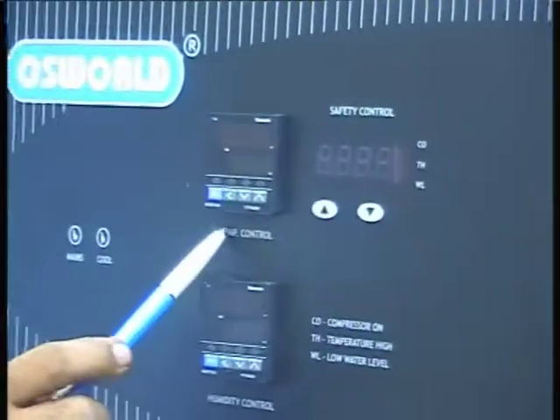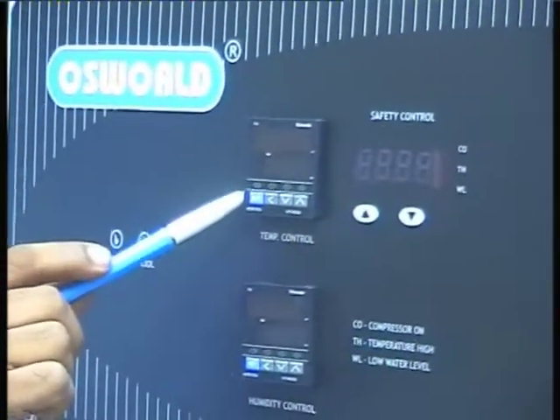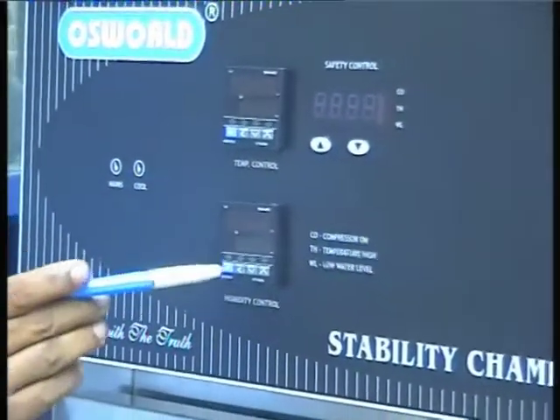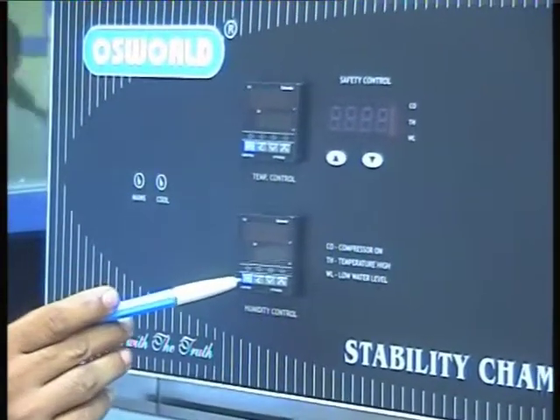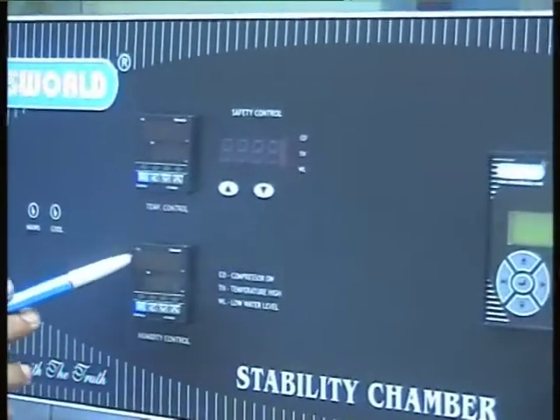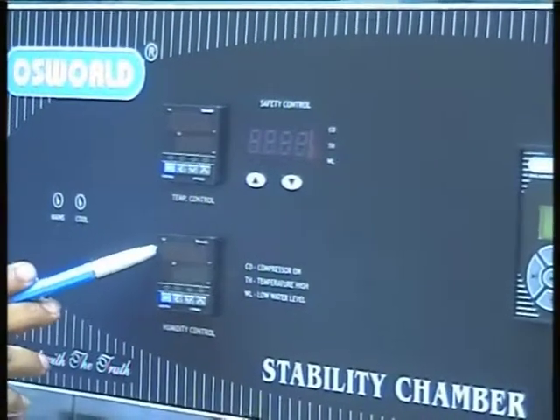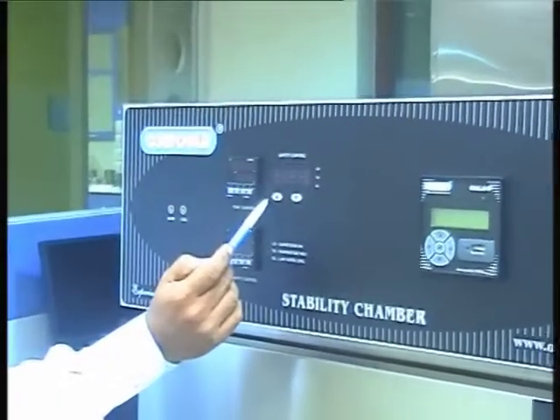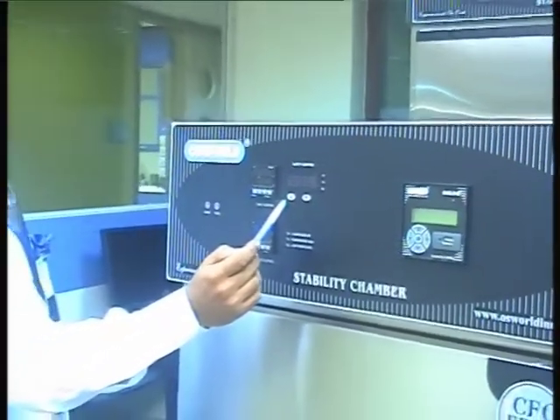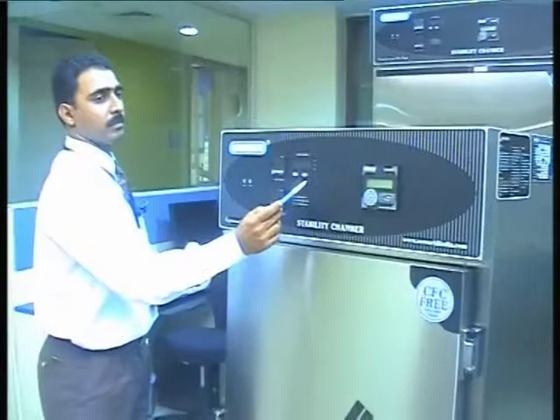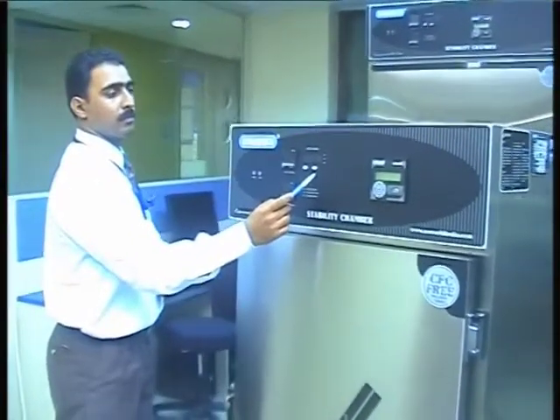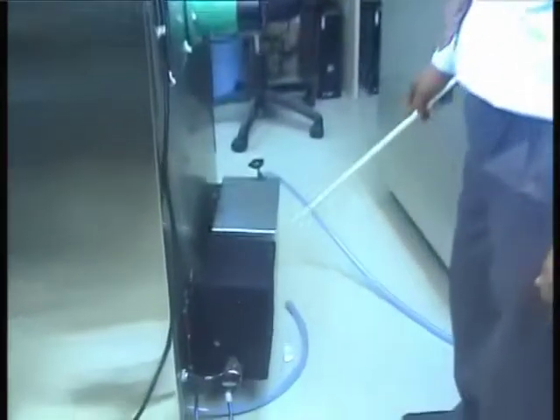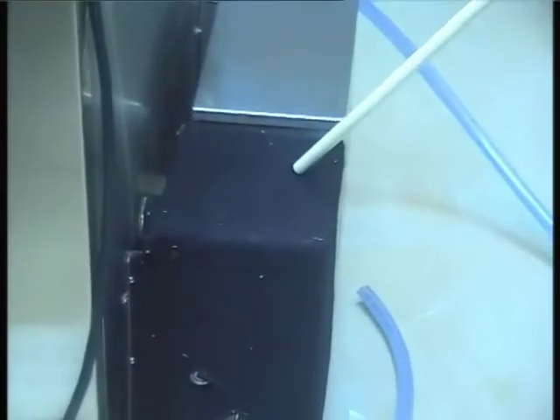The temperature controller maintains the temperature inside the chamber as per the required conditions. The humidity controller maintains humidity within the chamber as per the set conditions. The safety controller safeguards against an accidental temperature rise and cuts off the boiler heater and air heater when the temperature reaches the safety control temperature. The stability chamber also has a steam generator and reservoir.